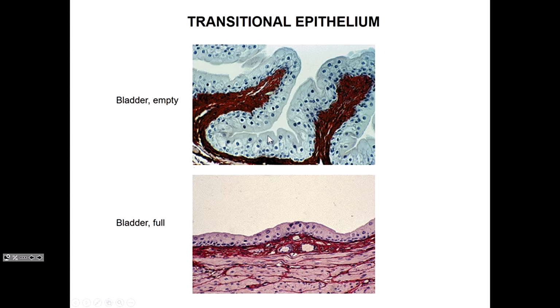As a good example. And if you look at the text online, I think in Junqueira, they show a picture of binucleated cells of bladder, transitional epithelium. Yes, it's possible they're a little bit lower down, but I've only ever seen them on top. There's always that rare example where it pops up where it's not supposed to be. But for 99% of the cases, it's going to be on top. Question in the back.